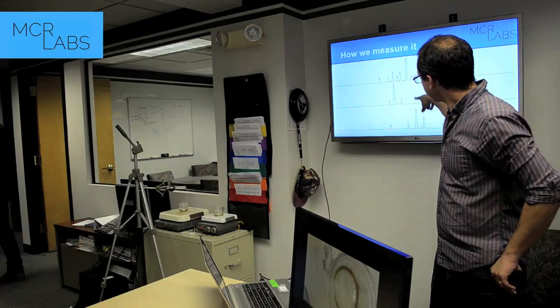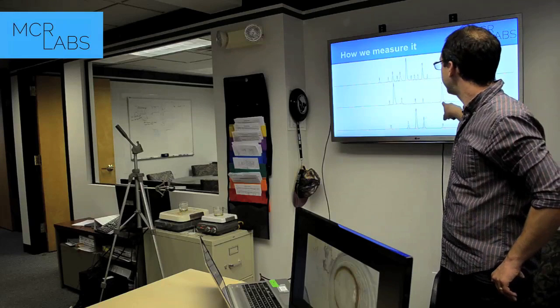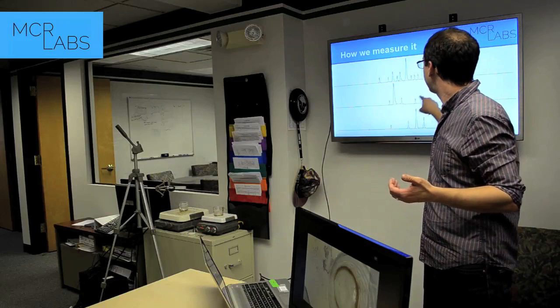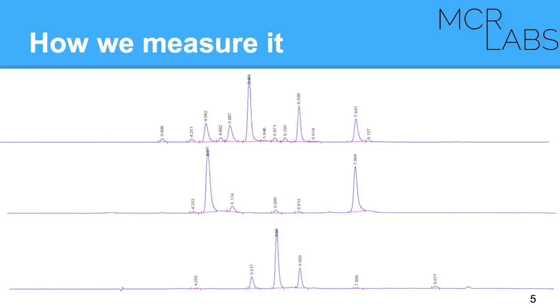This is where THC comes out. There's very little THC compared to the THCa and the CBDa in the flower, because the flower doesn't produce THC, it produces THCa. Okay? This is another sample, a different sample. This is a decarboxylated edible. Okay, this is an edible from which we extracted all the cannabinoids. And what you see here is that there's very little THCa and a whole bunch of THC.